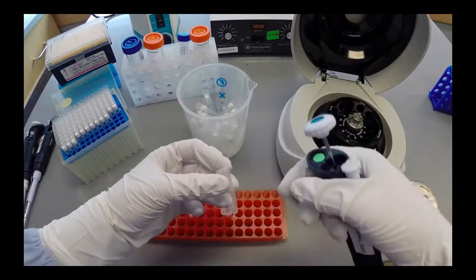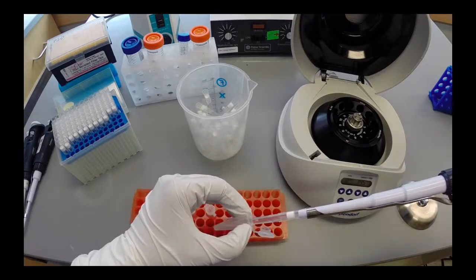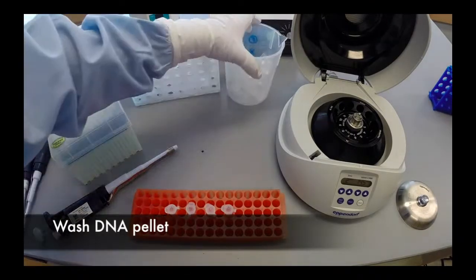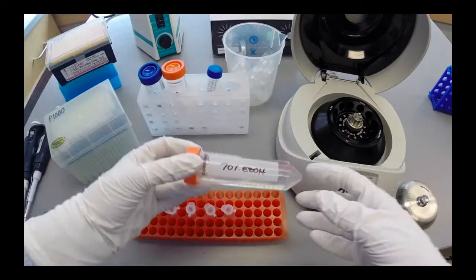Visually inspect the tube to see if the pellet is still present. If it has gone missing, make a note of that. Clean the DNA pellet by adding 250 microliters of 70% ethanol to each sample.